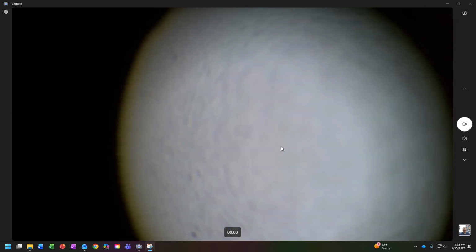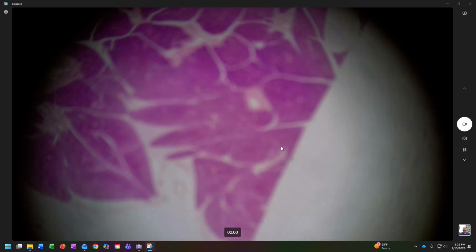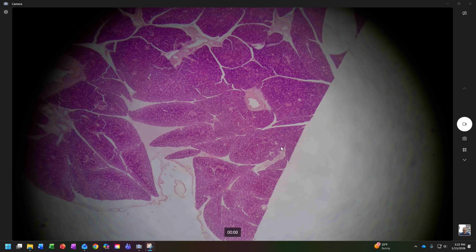Hopefully that was a little valuable, and you could see at least how I want you to think about these slides. Again, we don't want to try to memorize a color. We're not trying to memorize a picture. We're trying to understand a concept. Okay. Now, I think this one ends up being a good one.